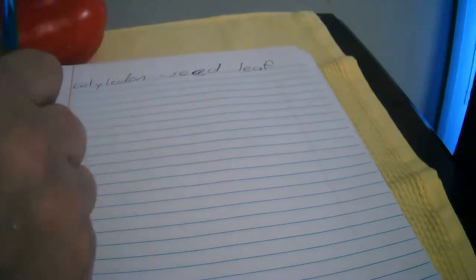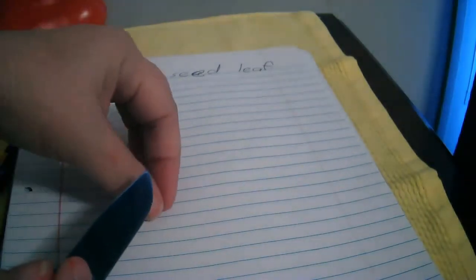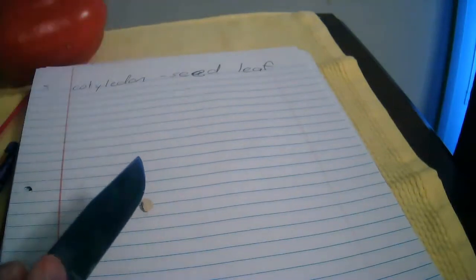But so if I cut this in half, I'm going to do this real carefully. Okay, I finally got the little black-eyed pea cut open in half, and you can see that there are two halves. I'm trying to put them to where you can actually see them, like opposite each other.